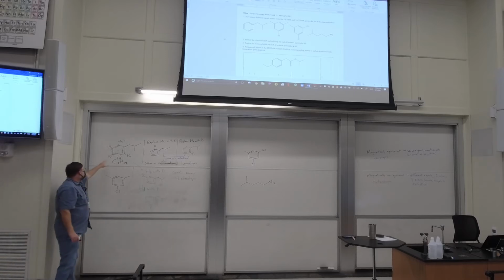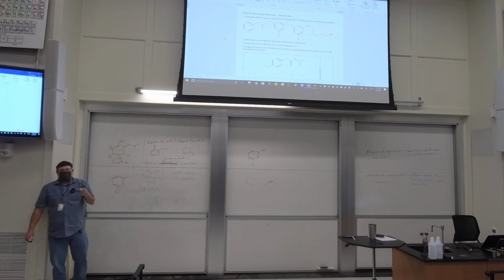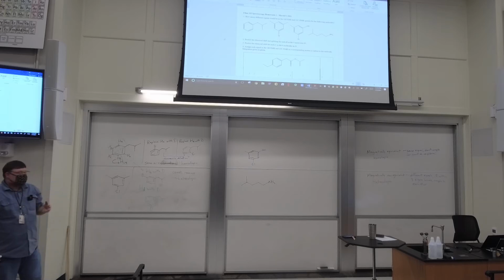And then HC is not like any of these. HC is directly across from the atom that's got the isobutyl group. None of the others are. So HA and HE, that's one signal. HB and HD, that's a second signal. And HC is a third signal, sorry, can't count. So that's three signals from the aromatic group.